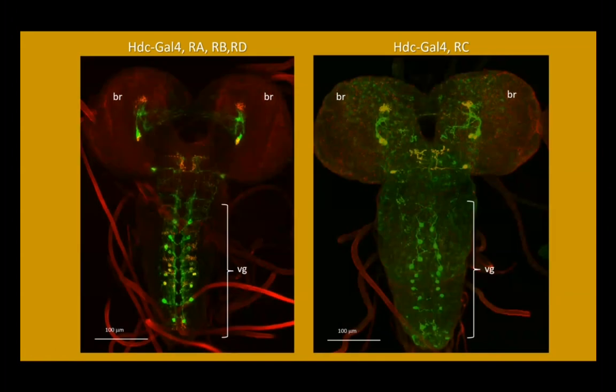And here is the combined image of the GFP and histamine-like immunoreactivity. What we can take away from this is that there is a difference between the expression of GFP and histamine-like immunoreactivity between the two different Hdc Gal4 hybrid genes.